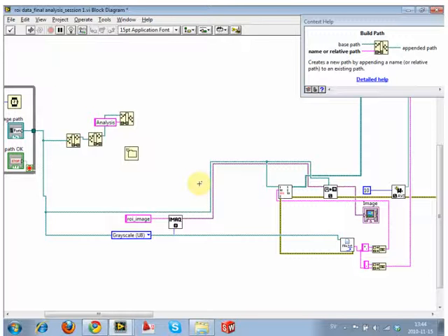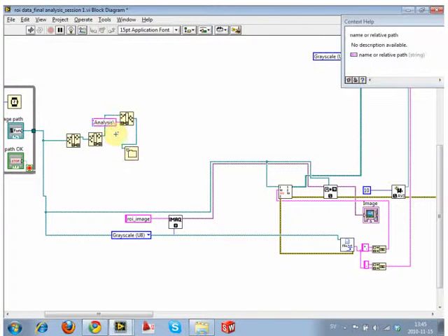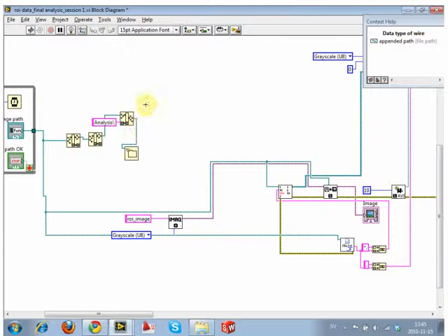What we need to do is put a switch on there, which indicates this is a folder. And just like when you're typing out folder names, the slash indicates this is a directory structure. So we put this little directory structure switch in there, and then when we say, this is how I want your path naming, it knows that it's not trying to name a file, it's trying to name a folder. And then we build this folder, and now we are making an analysis folder. This is the path for that folder, and that's as simple or as difficult as that section is. We now have our new folder that we can start to dump things into.